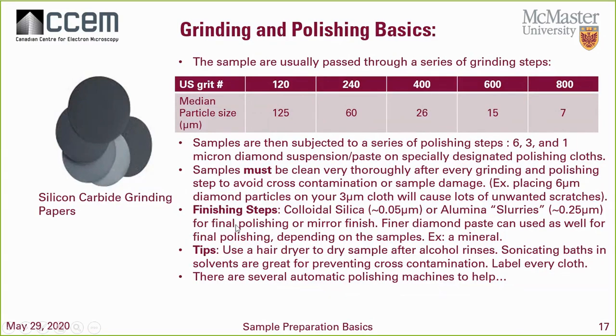And for finishing steps, after your 6, 3, and 1 micron, we want to go into our slurries, or as I call that, just our polishing. So I go grinding, polishing, and then I say final polishing for the finishing steps. And usually these are submicron, and you can do this depending on your application.